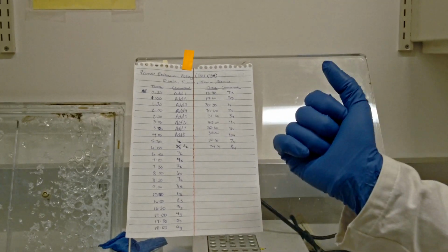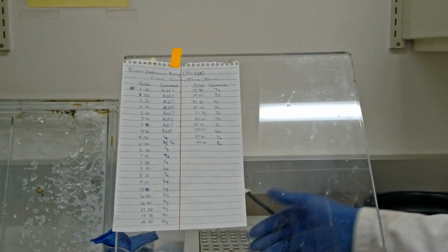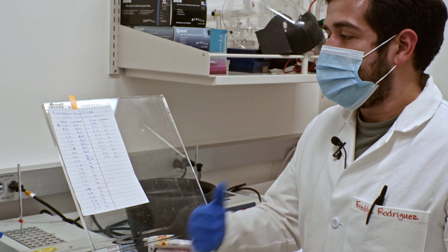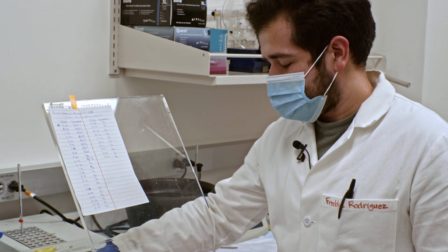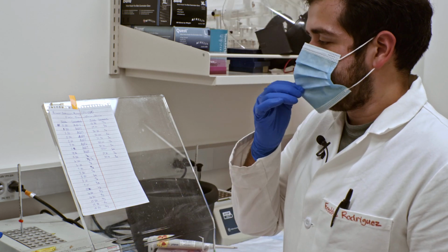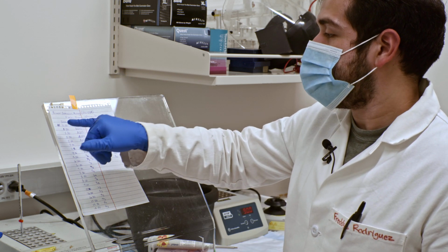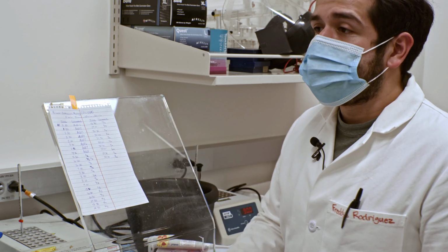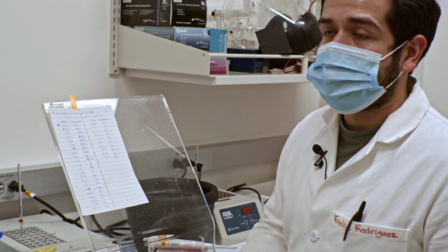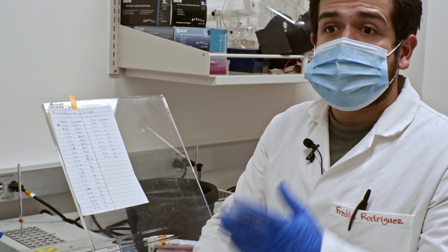You want to get your sample into a quencher in order to collect that time point. So the way that I do this, especially since I only have 8 samples, is I do 30-second intervals. This timesheet helps me figure out when to take samples into a respective sample vessel, where I can just quench the reaction. What I do is sample acquisition every 30 seconds. For example, at time 30 seconds, I add 1. What that means to me is I get an aliquot of dNTPs with a 50 micromolar concentration and add it to reaction vessel 1. And then I put it on the heat block and let it incubate at 37 degrees Celsius.